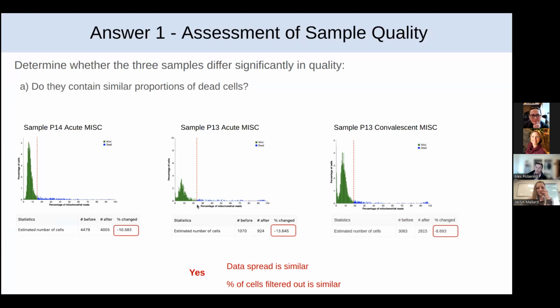Absolutely. So usually you don't need to decide. Usually the default's pretty good. But what it essentially is doing here is just removing outliers from this plot. So it's looking 3 standard deviations above the median, and then it's discarding anything above that. That's how the actual threshold is calculated. You can see there's this distribution here, and then there's this long tail of outliers.